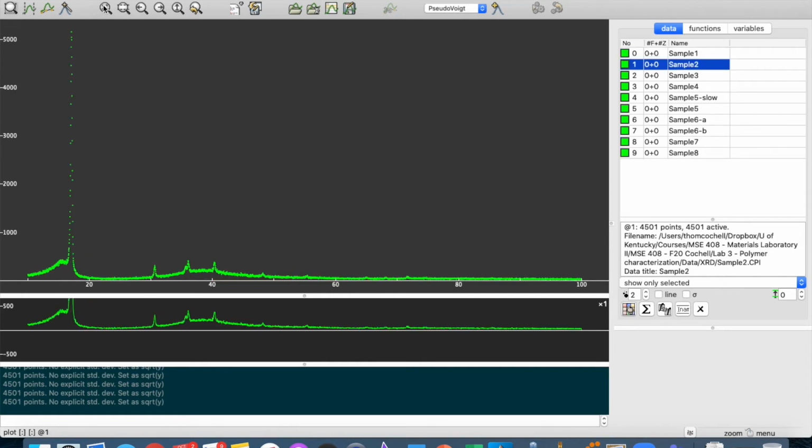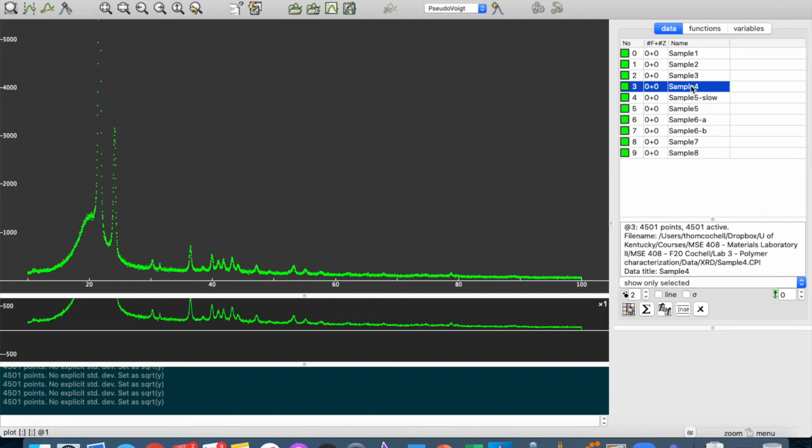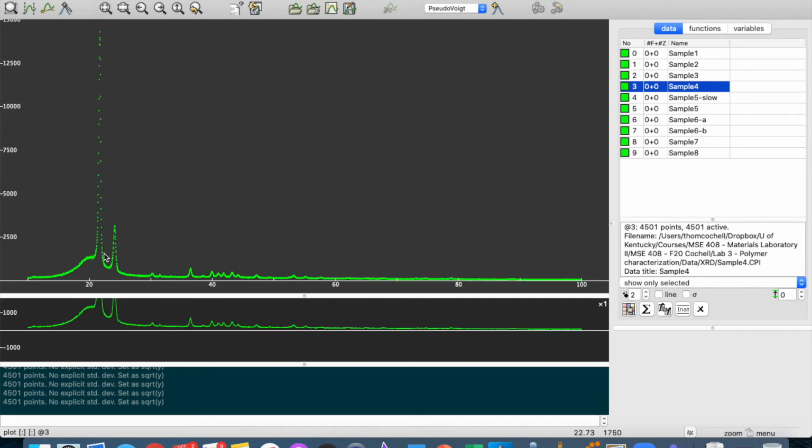And 4 and 2, you see here, they have pretty distinct peaks, right? If we look at both of those, pretty distinct peaks, and lots more of them than some of the other patterns, right? So again, that tells you something compared to what the others told us.